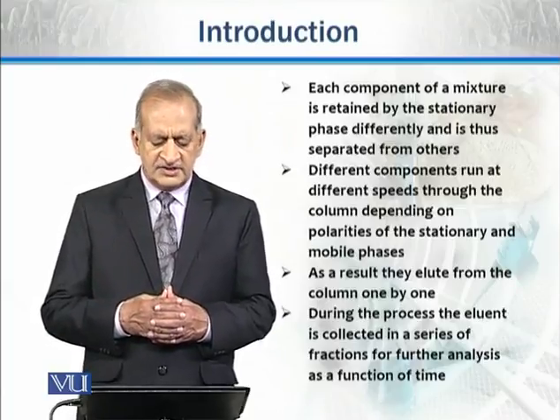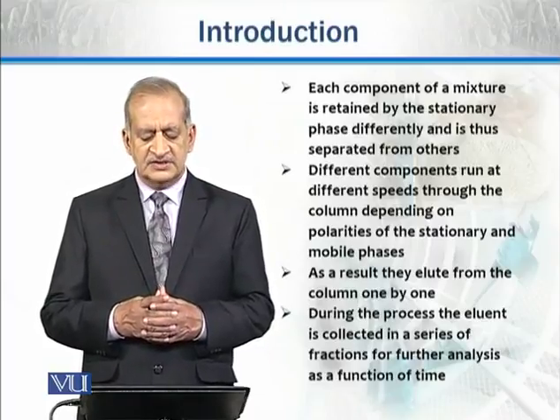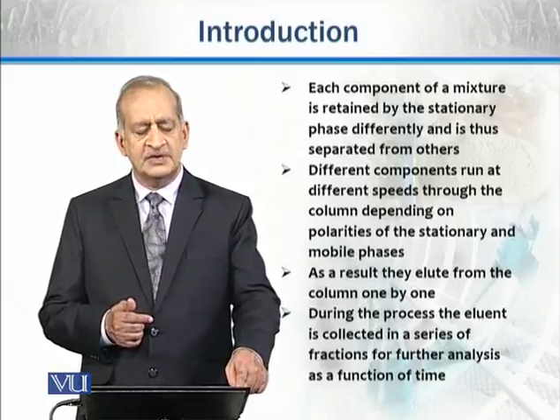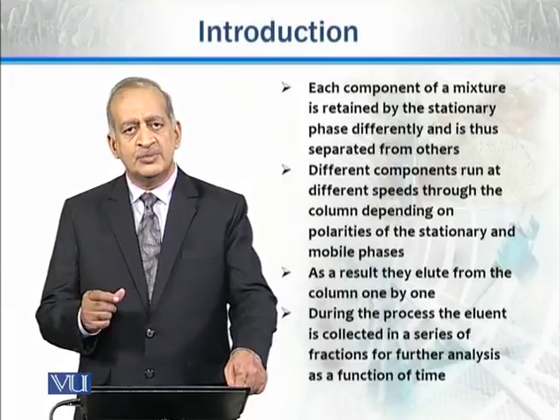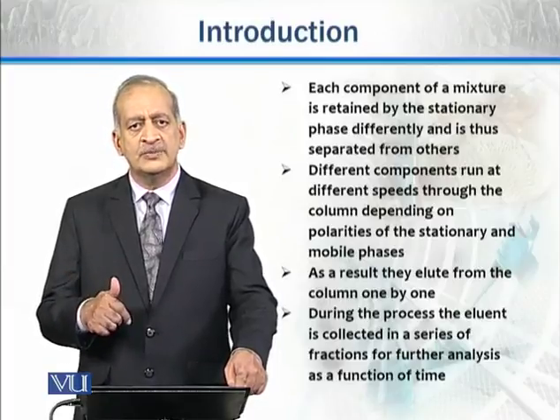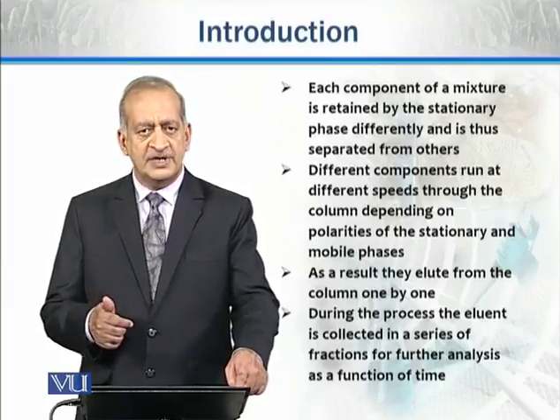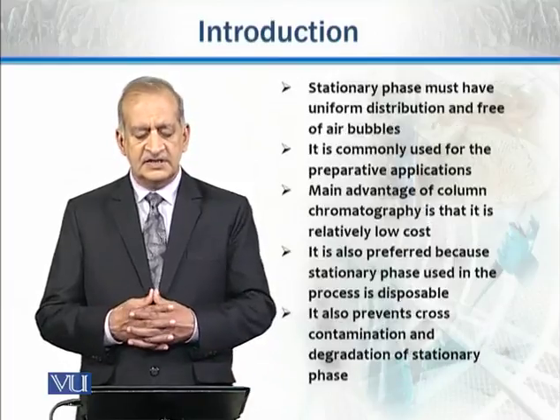During this process, the eluent is collected in a series of fractions for further analysis as a function of time. So whenever this elution takes place, different components are eluted through the column at different times. So as a function of time, they are separated, they are collected, and then they are analyzed for further analysis.